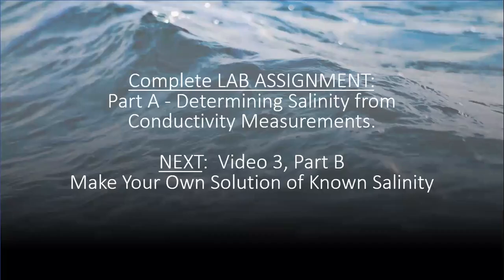It's now time to complete your lab assignment. Part A, determining salinity from conductivity measurements. Then watch video 3, Part B, make your own solution of known salinity, and please address your questions to your lab TA.